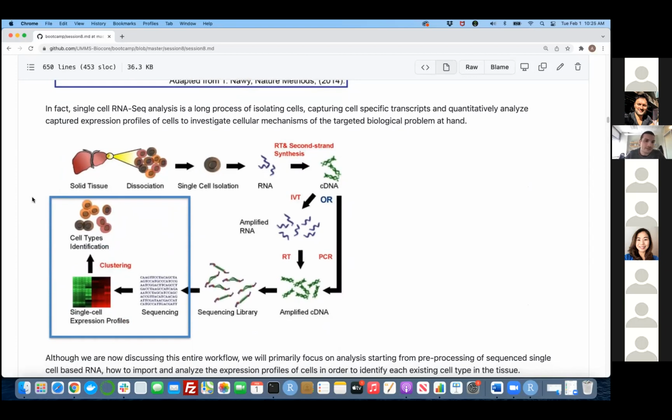The reason for that is once we extract the RNA, we are trying to see that all the RNA within that isolated space actually have RNA from the same cell, or potentially from the same cell. We're going to see some examples where it may not be the case. There may be two cells within the same isolation. It is possible, because it's a really, really hard problem in practice.